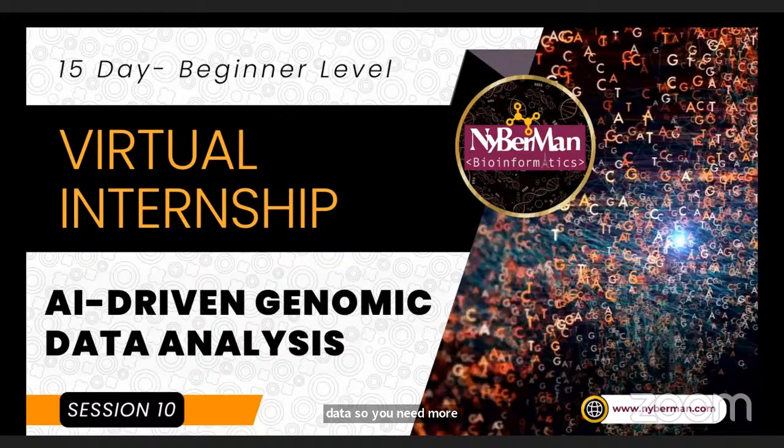And you will need at least 32 GB for RNA-seq analysis if you are performing it on your laptop or PC, not on a web-based platform. For example, in Galaxy you can perform the analysis, so there you may not need a computationally high system.